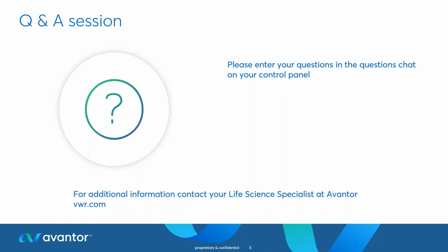A question about duplex reads. How do I generate duplex reads? Is it a different protocol or chemistry? So duplex capabilities are already built into our new version 14 or V14 kits and the new R10.4.1 pore chemistry. You just need to turn on duplex-based calling in MinKNOW, which is our software, before starting your sequencing run. This is because we use a different algorithm to produce duplex data and pair up the template and complement strands. Other than turning it on, you don't need to do anything special with your sample. It's all built into the new chemistry.